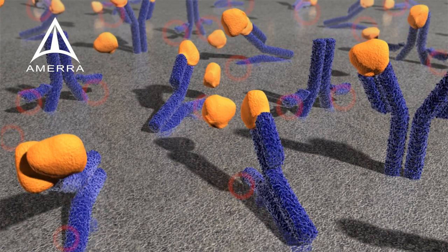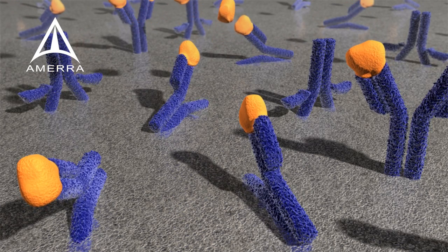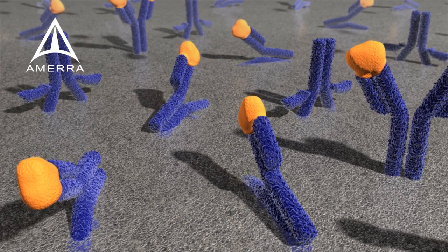Preserving the 3D structure of antibodies on a synthetic surface and improving access to the antigen binding sites is of utmost importance, and that is where Mix & Go makes a real difference.